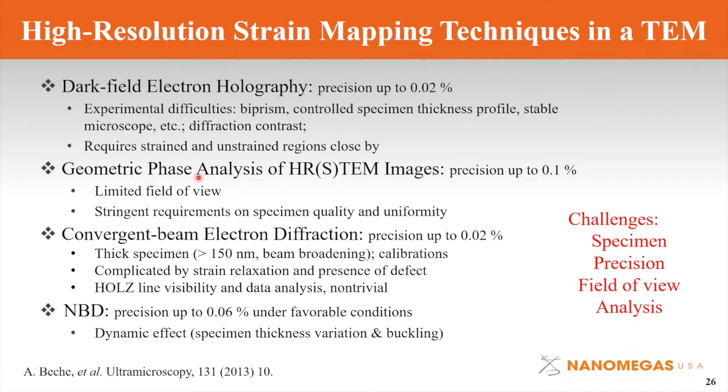The geometric phase analysis of high-resolution images: the precision is reasonable, not super high, but this technique is super easy to implement. It does struggle with limited field of view because you do need to get a high-resolution image, and the specimen quality, the better the better.